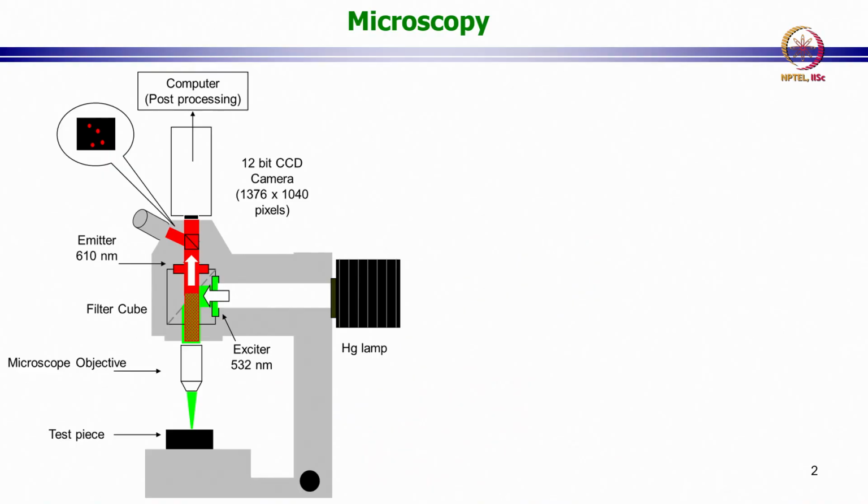Especially in the field of biology, microfluidics is often a go-to tool for imaging flow around cells, or movement of cells. In such a case, when the object becomes very small, you have to use an appropriate optical technique, which often is the optical microscope. Now in the lab you will see an inverted microscope. Here I have drawn an upright microscope.